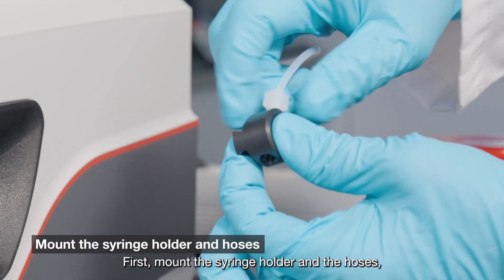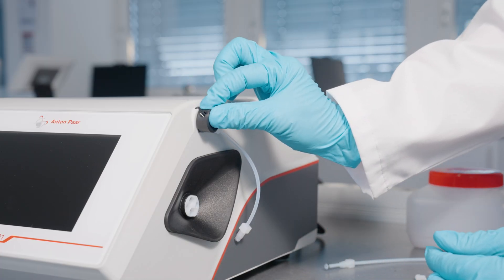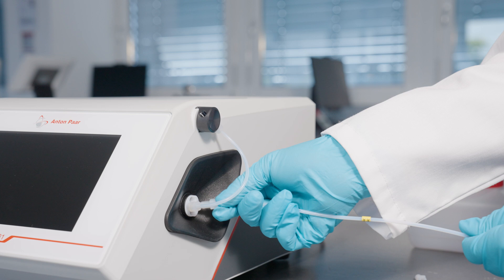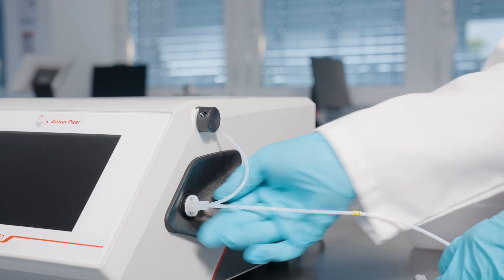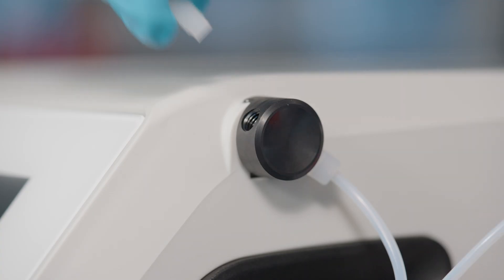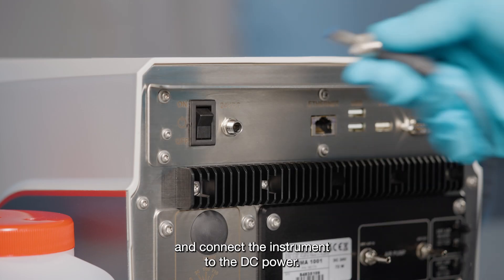First, mount the syringe holder and the hoses. Then connect the instrument to the DC power.